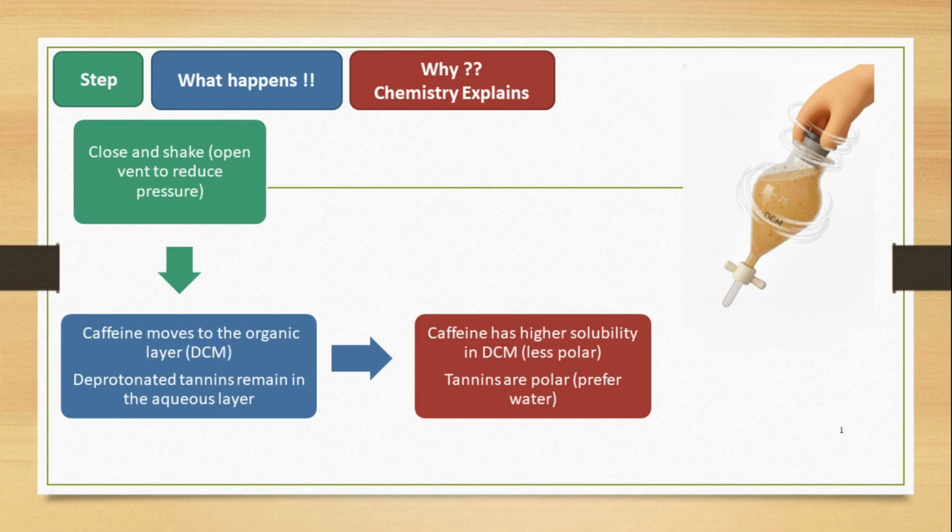This step highlights the power of solubility. Neutral caffeine molecules find the moderately polar DCM environment far more suitable than the highly polar aqueous layer. Polar tannins remain in water. This selective migration is the entire basis of liquid-liquid extraction.